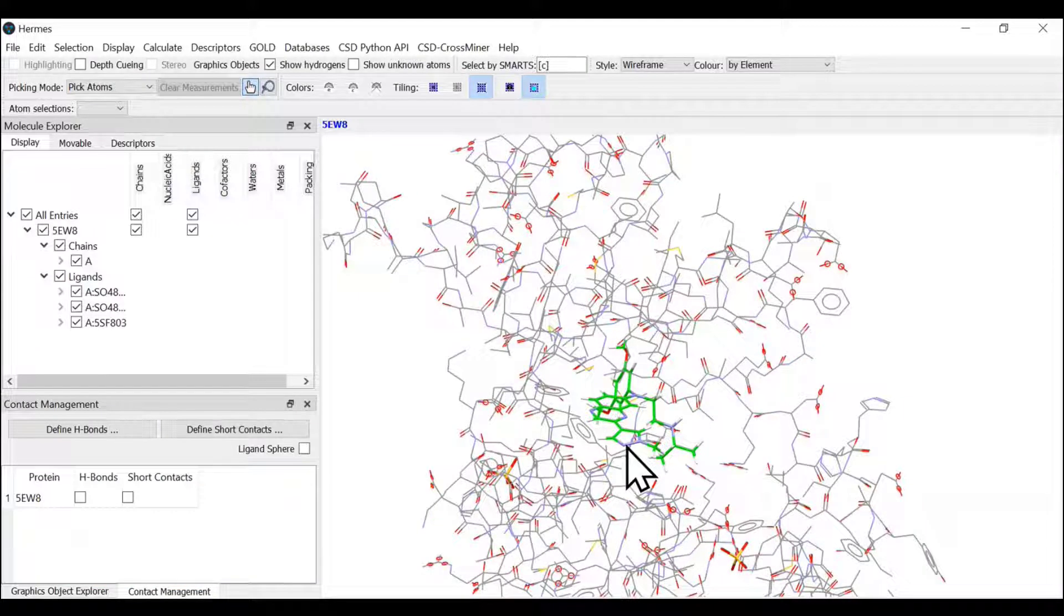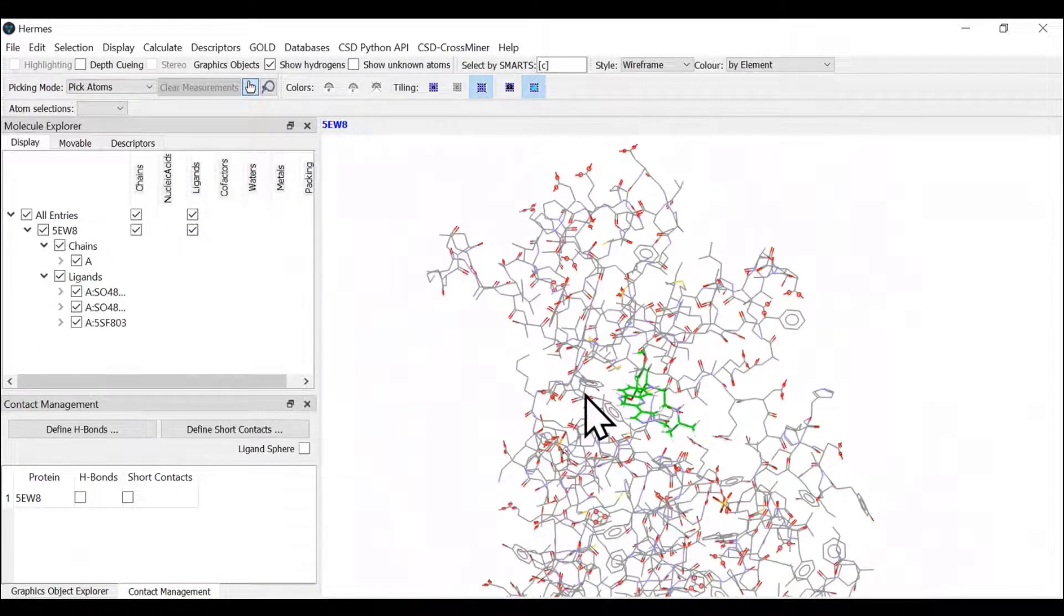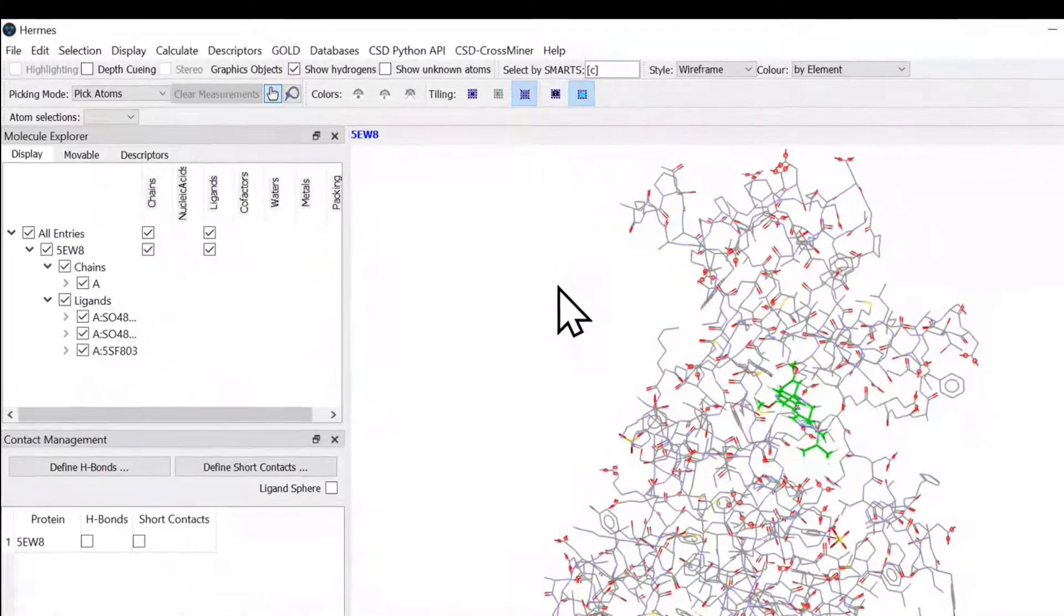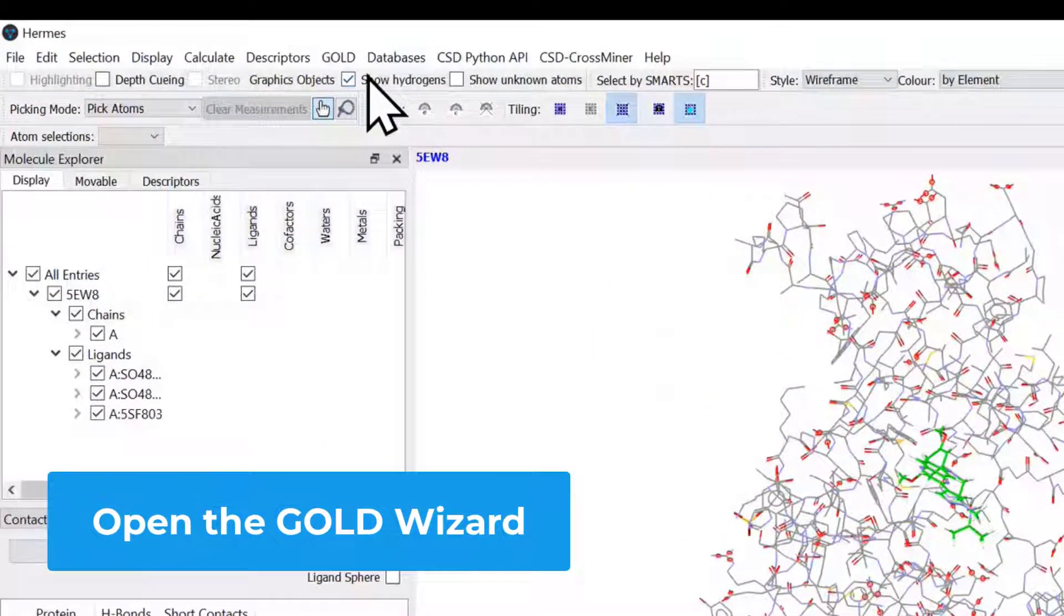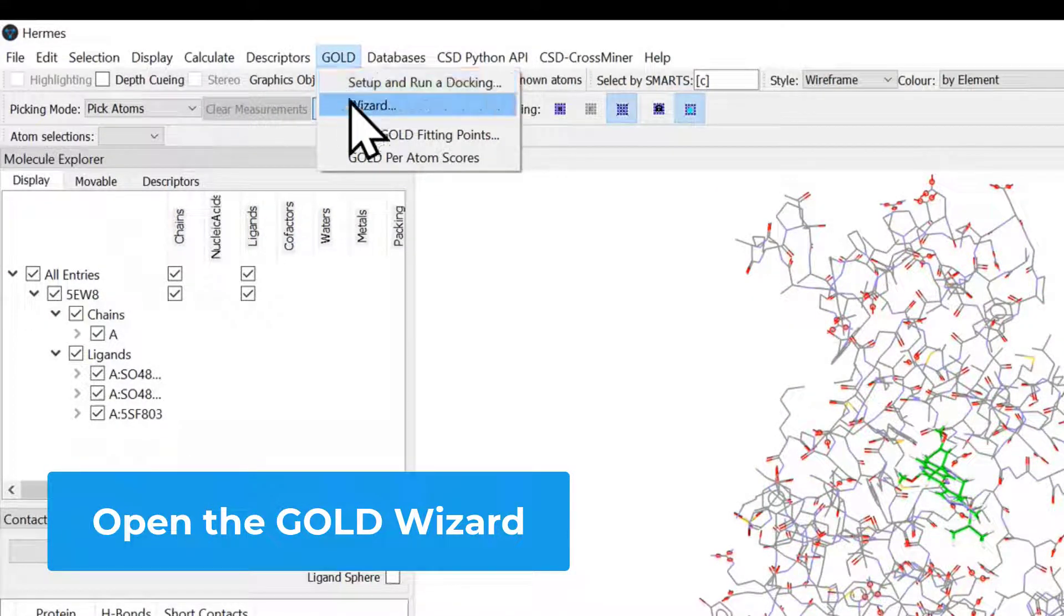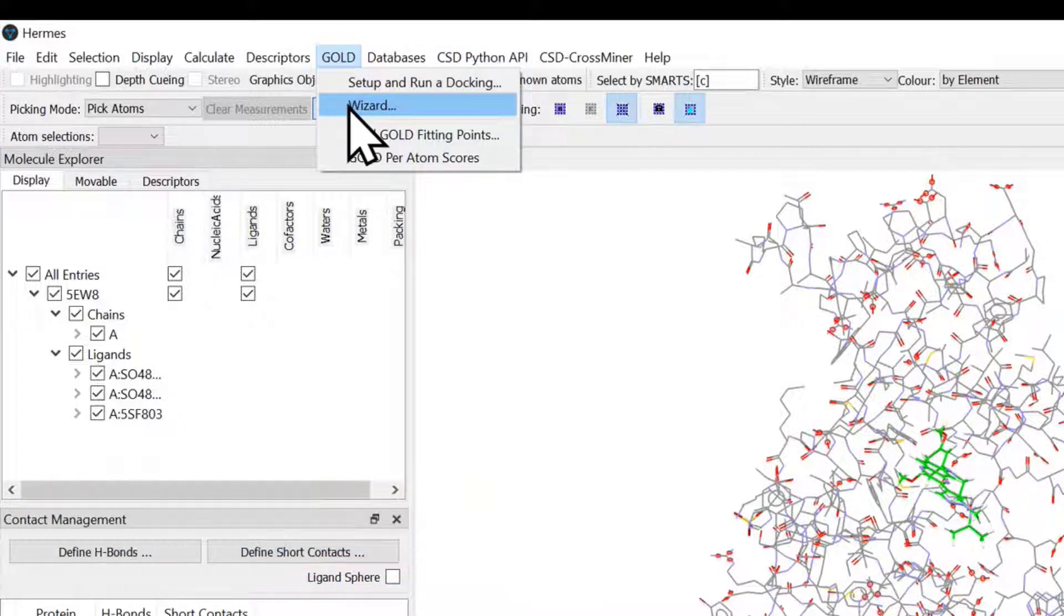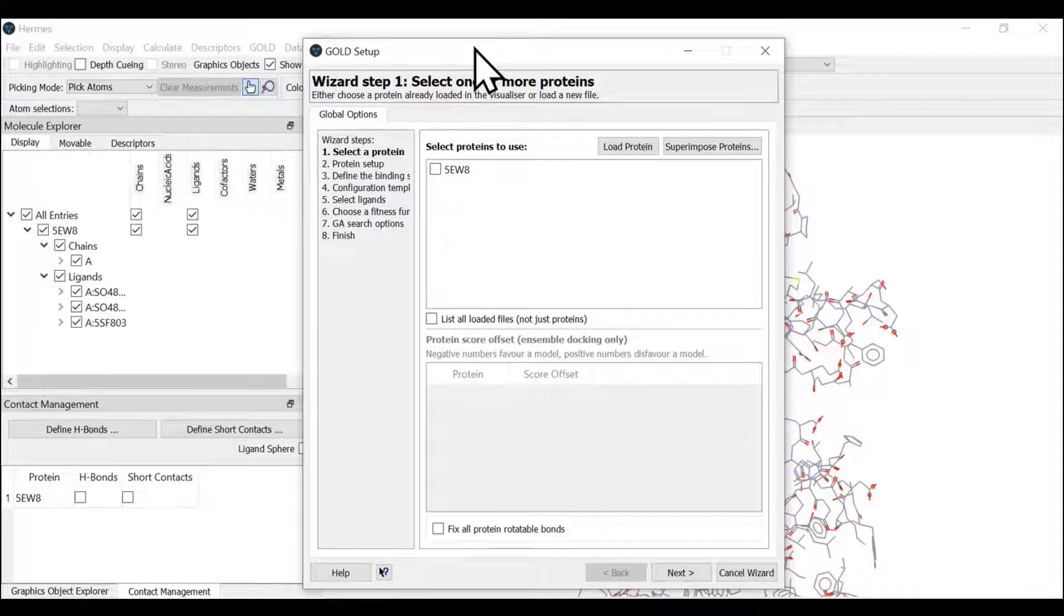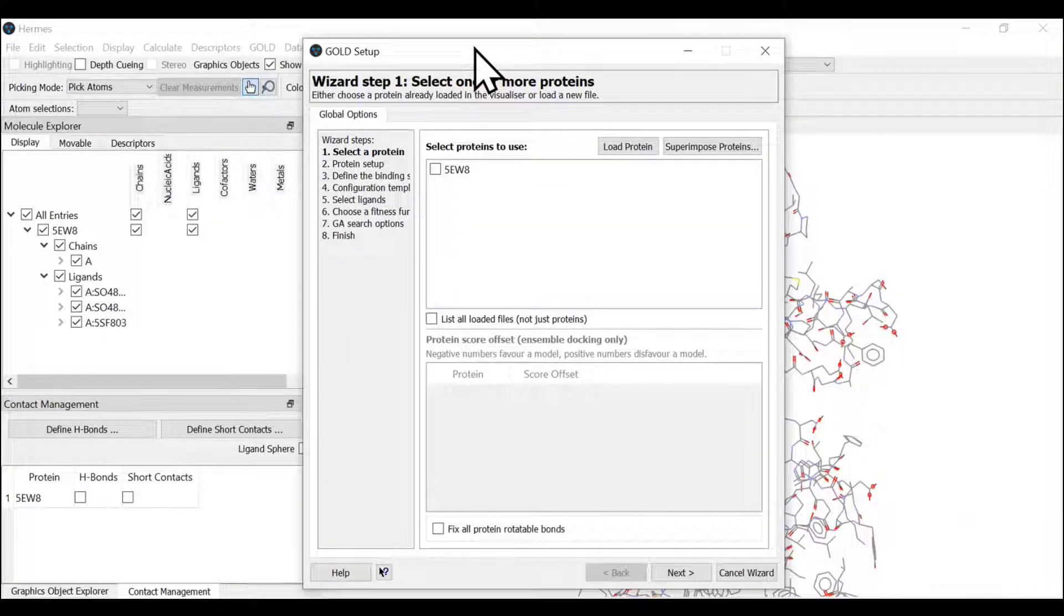Now let us start setting up the GOLD docking calculation. We can launch GOLD from Hermes by selecting GOLD. There are two options: setup and run a docking calculation, and wizard. We're going to start with wizard. This GOLD setup wizard helps you in setting up calculations in an easy way.